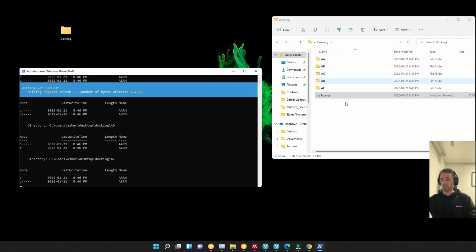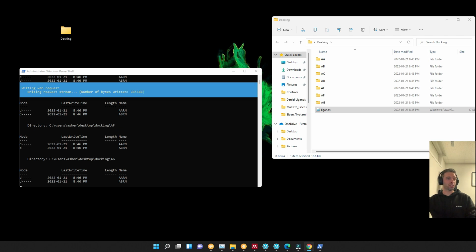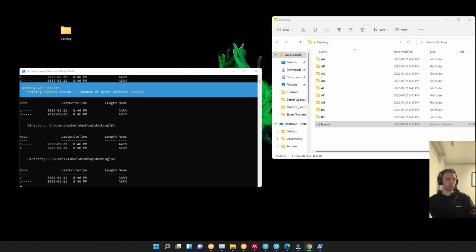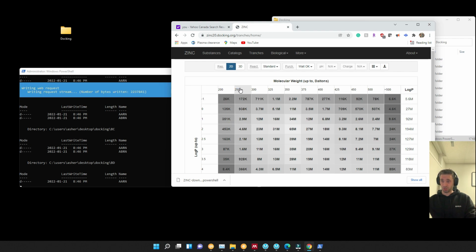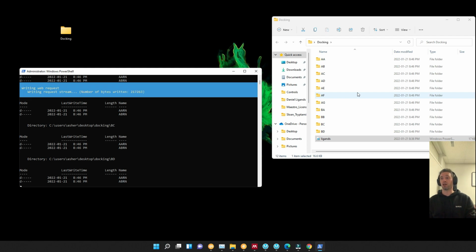So for example, AA, AB, AC, this would correspond to, AA would be this tranche, AB would be this one, AC would be this one. So AB, BA would be this one, BB would be this one, and so on and so forth. So it's just populating all of those folders into our computer.